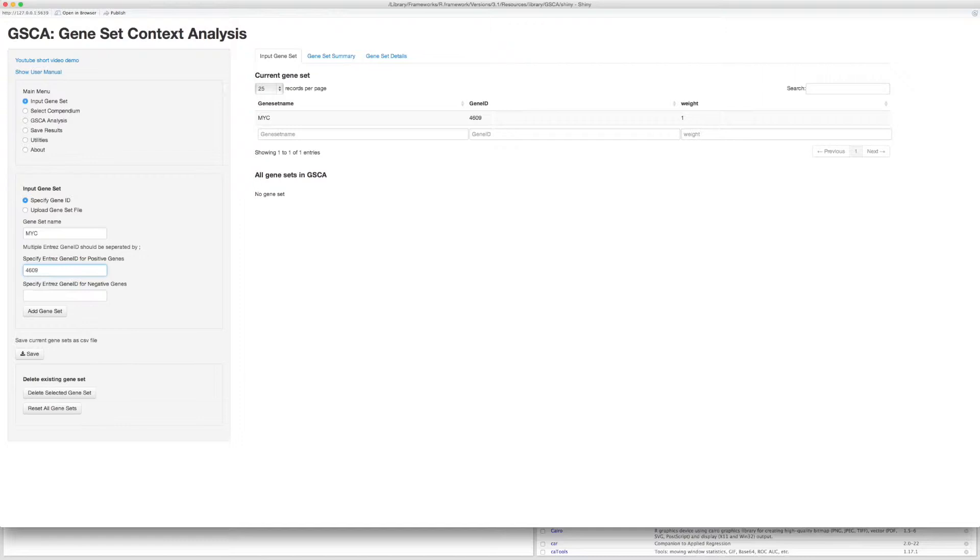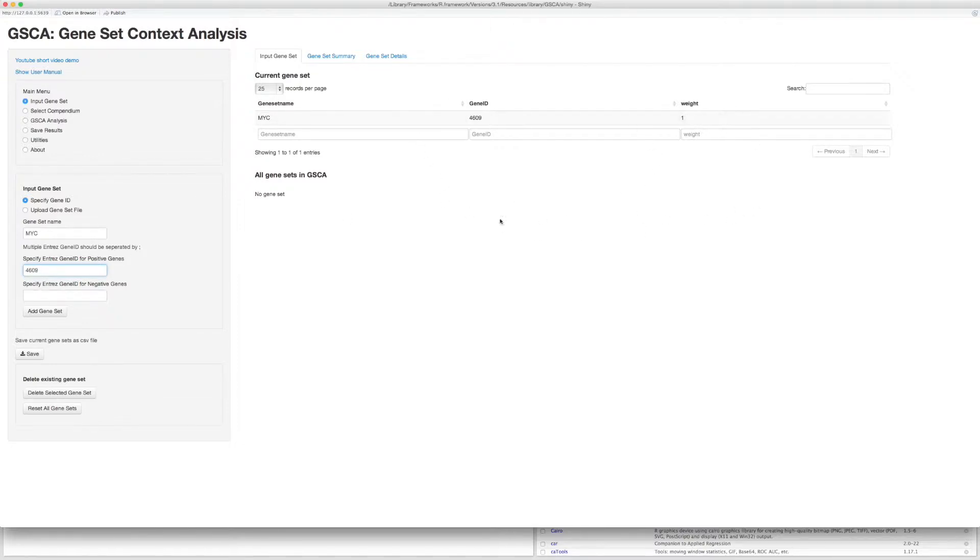For a gene set with only one gene, typically you should specify the gene as a positive gene. Notice that now a table will pop up here showing the gene set you have just given. Click Add Gene Set button if you have finished adding the gene set.